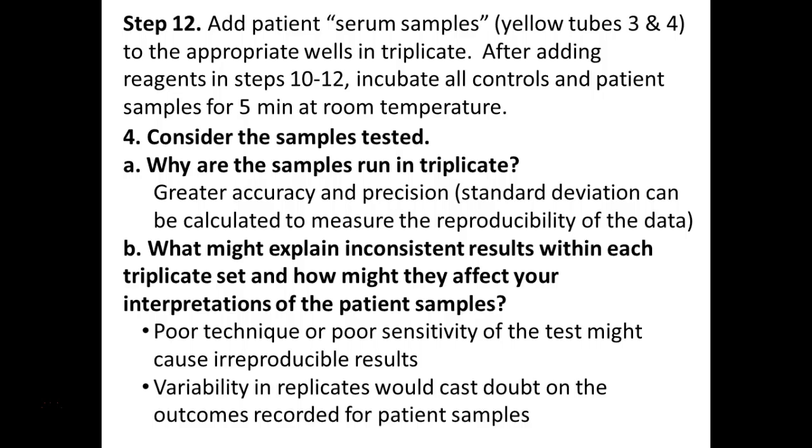Variabilities in your replicates, right? Say our positive control, 2 of them come out really bright blue and the other one nothing. You're not going to say, oh yeah, it's fine. No, because they should all be exactly the same, right? If they are truly the same, they should all be exactly the same.